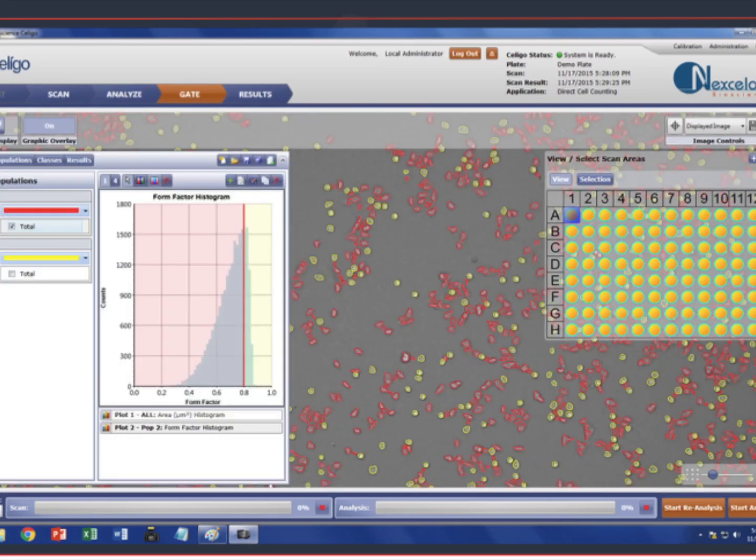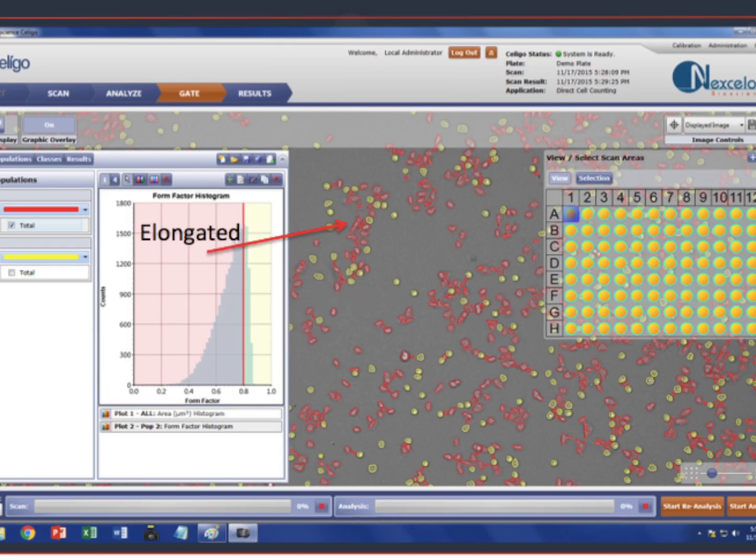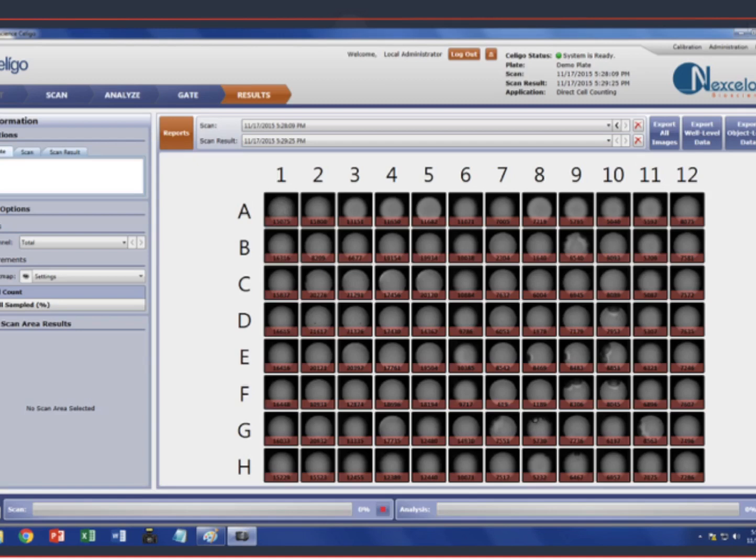Further segmentation of cell populations can be accomplished using FAC-Select gating. Here, cells are segmented based on their shape. Rounded cells with a form factor value close to 1 are highlighted in yellow, while elongated cells are highlighted with a red region of interest. In the Results tab, the numerical counting results can be exported on a whole plate basis to industry standard file types.